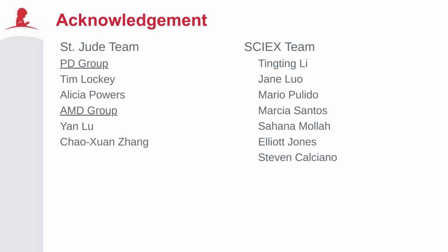I'm going to assume they're asking about what actual capillary or analysis method we're using, and the answer would be yes. It's an uncoated capillary that has the gel matrix inside of it, and that's used for both RNA and protein analysis, if that's what the person is referring to. Yes, inside the capillary. That would be a yes.